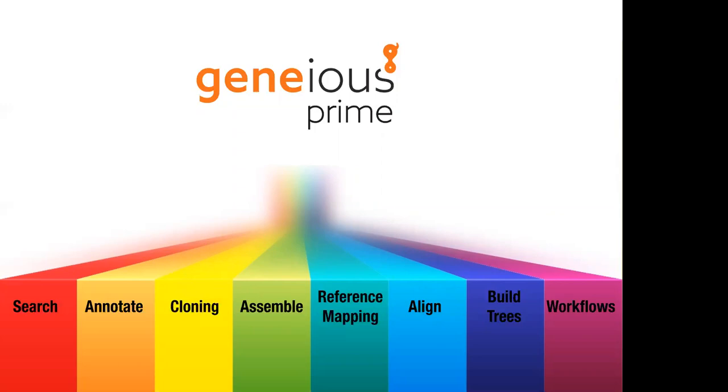Like I said, Rebecca sent through some topics in advance, so we're going to talk about a few different things here, things like annotations, working with primers. We'll talk a little bit about alignments and trees, as well as some NGS analyses with some SNP calling. Given the time and how many topics, I'm not going to be able to go in depth into everything, but I will show you where you can find more resources as well, so things like tutorials.